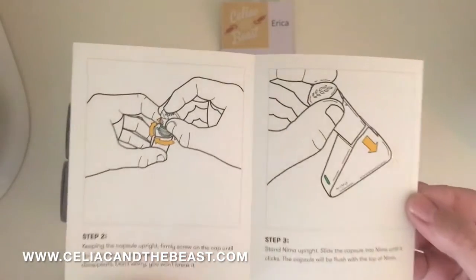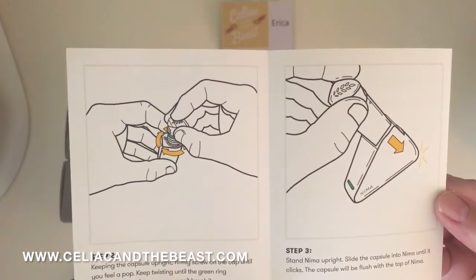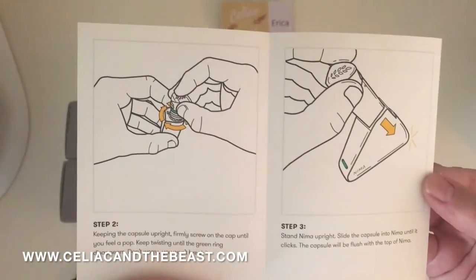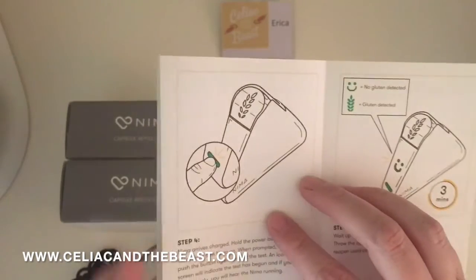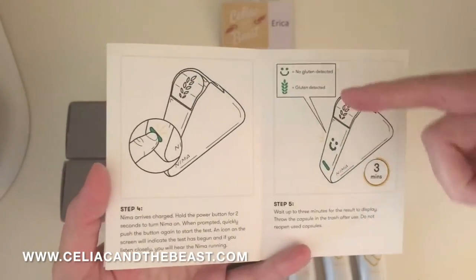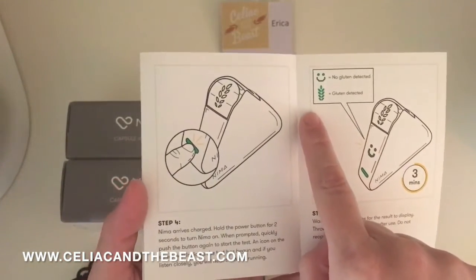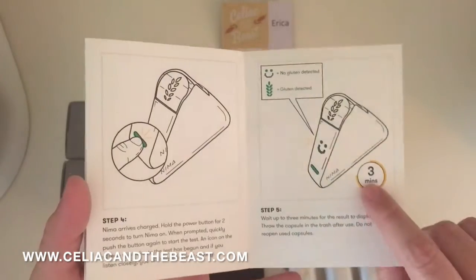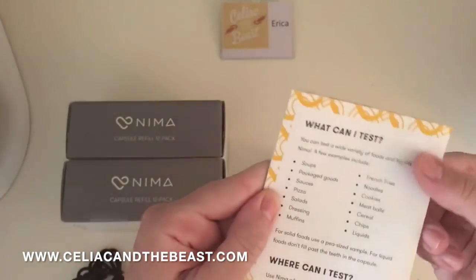Step two is putting a capsule in, which I luckily got a chance to do before. It's very unique — you're going to press firmer than you think. When screwing something new, you will feel a pop, and then you slide it in and turn it on. In earlier versions it showed a smiley face or sad face, but they've now changed the sad face to 'gluten detected,' which is awesome because it shows you exactly if gluten is present. It usually happens before three minutes — they're just giving you the three-minute timeline as well.